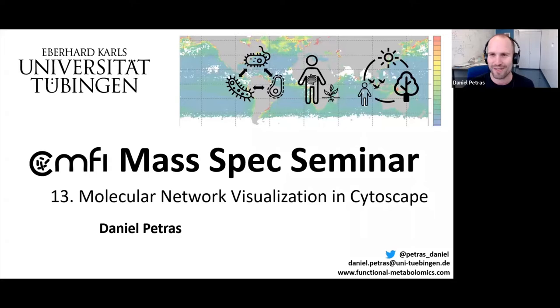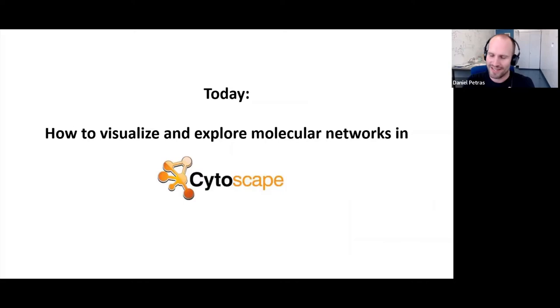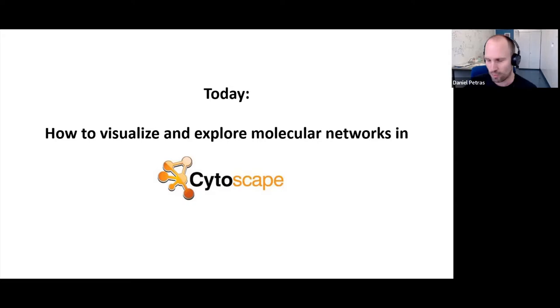Welcome everybody to our 13th round of the CMFI mass spec seminar. It's my great pleasure to introduce you today to Cytoscape and show you some tricks on how to visualize molecular networks within the Cytoscape platform. This is a pretty awesome tool that we use extensively for data visualization and exploration of molecular networks. Some of you may have used it already — I'm really fascinated by this awesome piece of open source software.